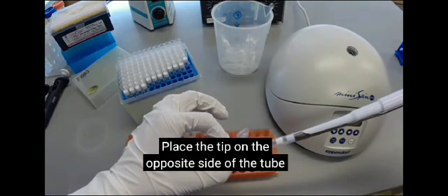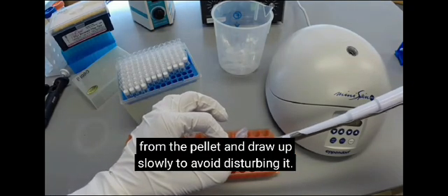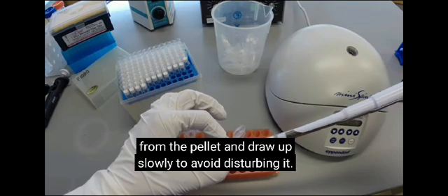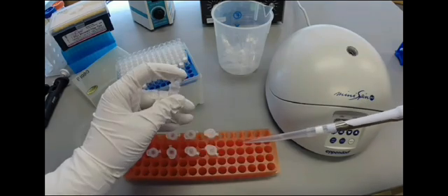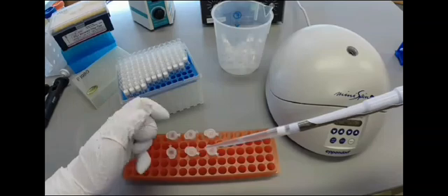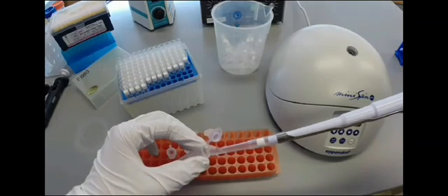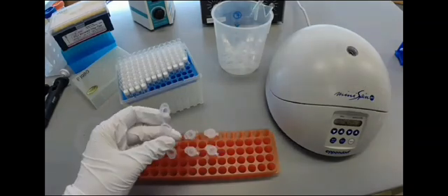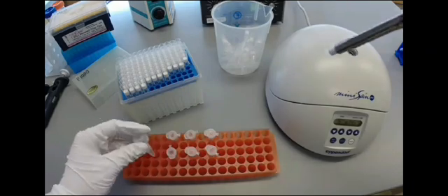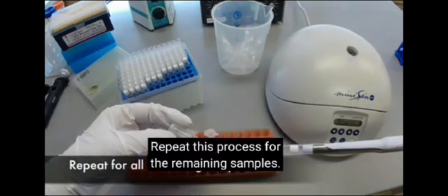Place the tip on the opposite side of the tube from the pellet and draw up slowly to avoid disturbing it. Repeat this process for the remaining samples.